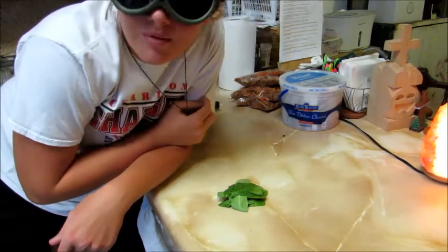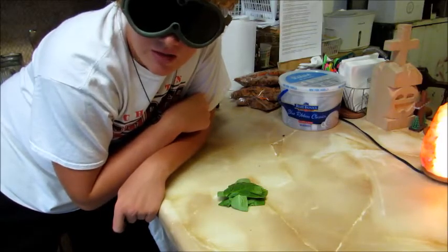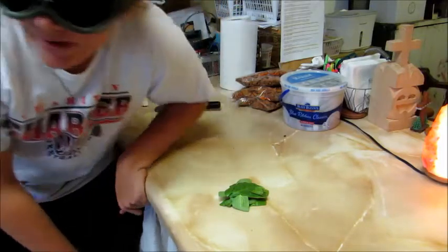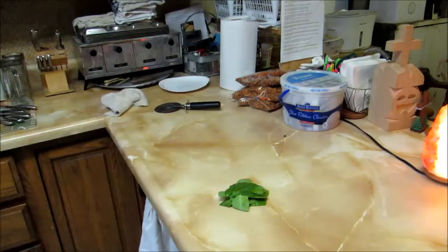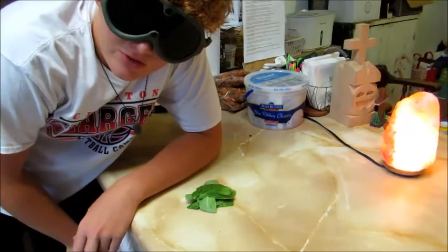Don't ingest plants in the laboratory. Looks good, but I'm not gonna eat it. Always wear gloves while handling plants in the laboratory. Wash your hands after handling plants in the laboratory. Don't inhale fumes of burning plants. Don't pick any wildflowers unless your teacher says it's okay.